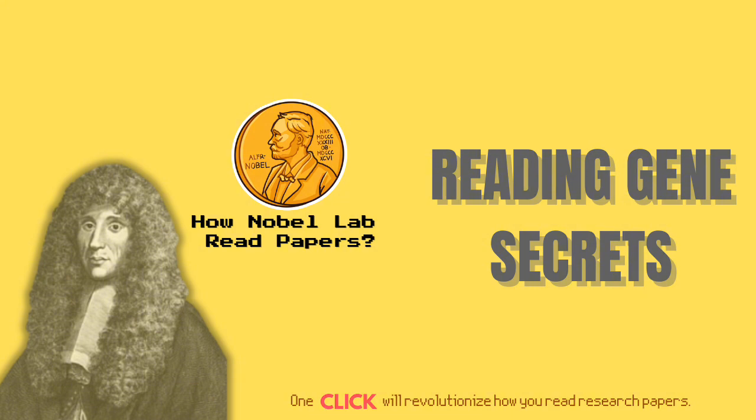And this is where the unbiased discovery power really comes in, because you're just sequencing whatever's there in an unbiased way. Yeah. You capture everything. Known genes, unknown genes, weird splice forms. You don't need prior info. You just find what's present.